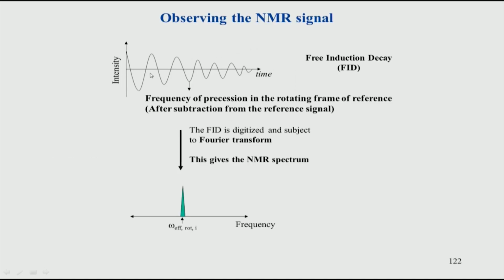With this free induction decay, you can do a Fourier transform and then you get a spectrum, or a peak. The oscillation is basically coming because the magnetization is rotating in the xy plane and it is also dephasing. The dephasing part is captured by this decrease, and the oscillation is captured by this frequency here. The oscillation is coming because of chemical shift. That is what we capture by Fourier transform; we get a peak corresponding to this oscillation frequency.